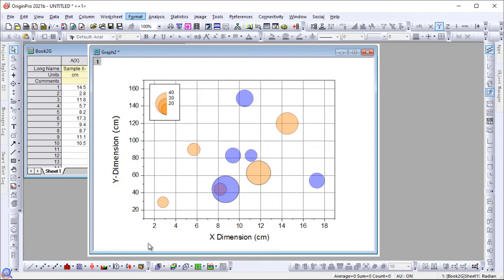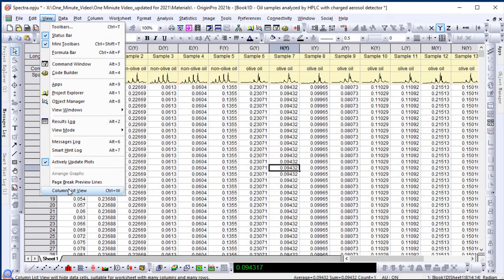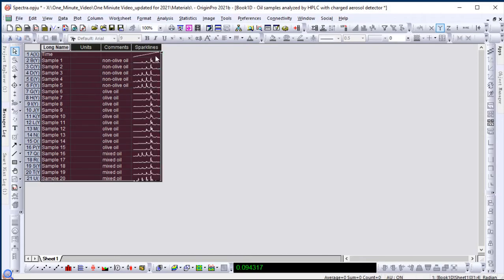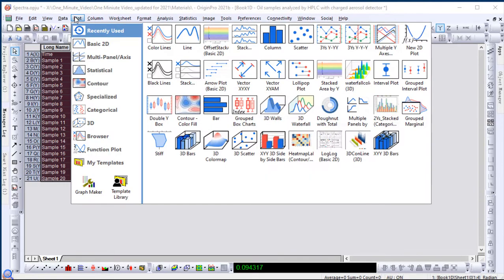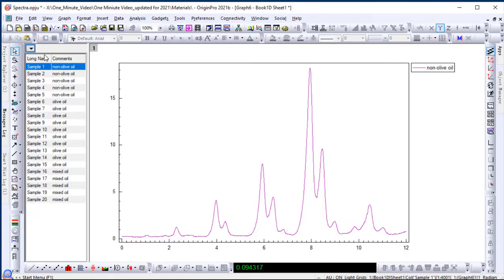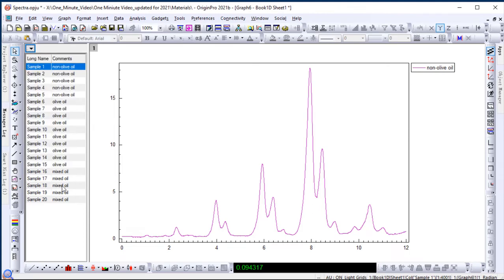For worksheets containing many columns of data, easily switch to a more compact list view. Create a browser graph and use the navigation panel to explore and compare multiple datasets.